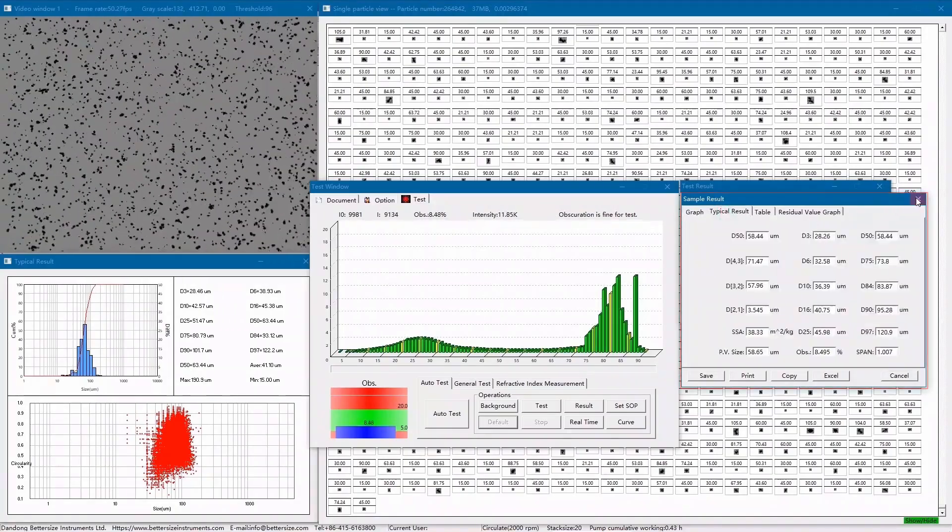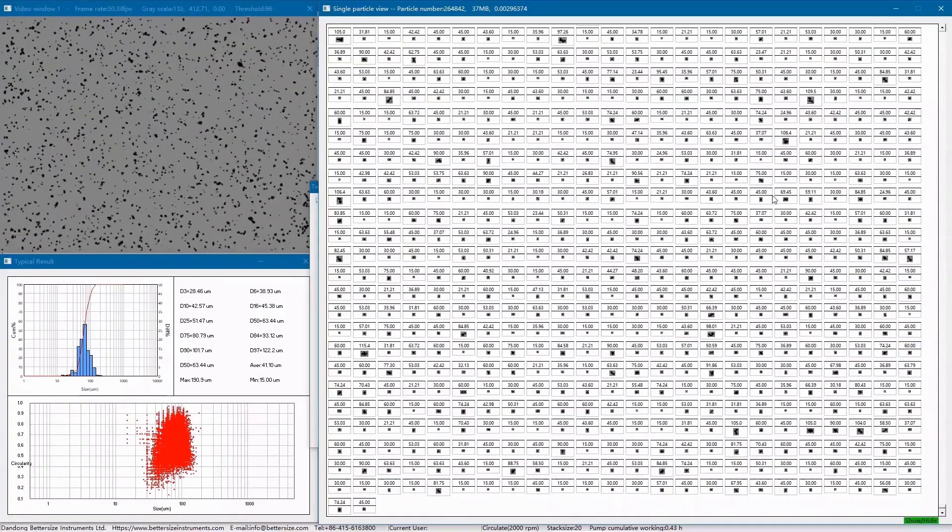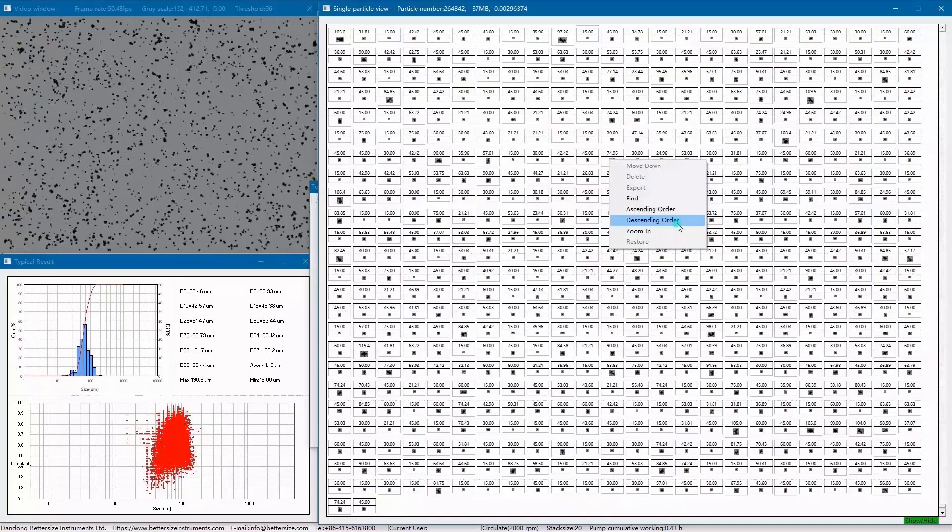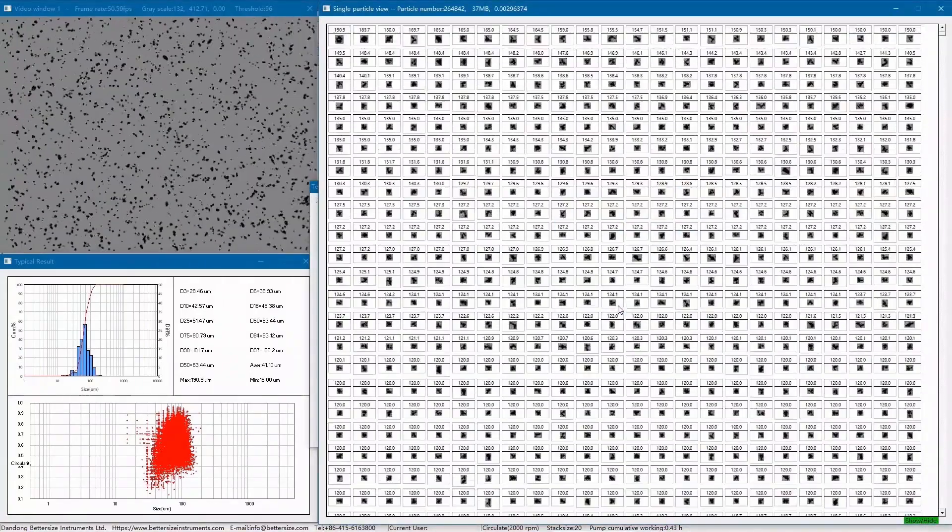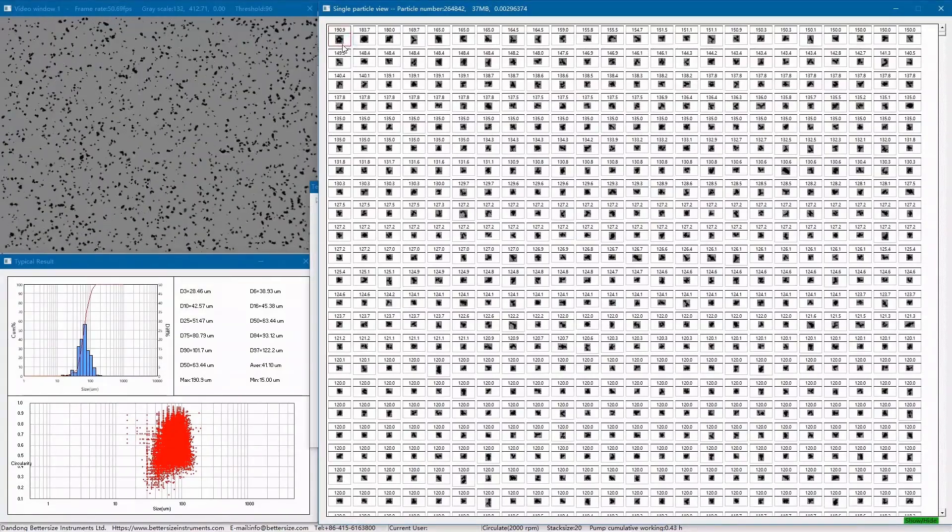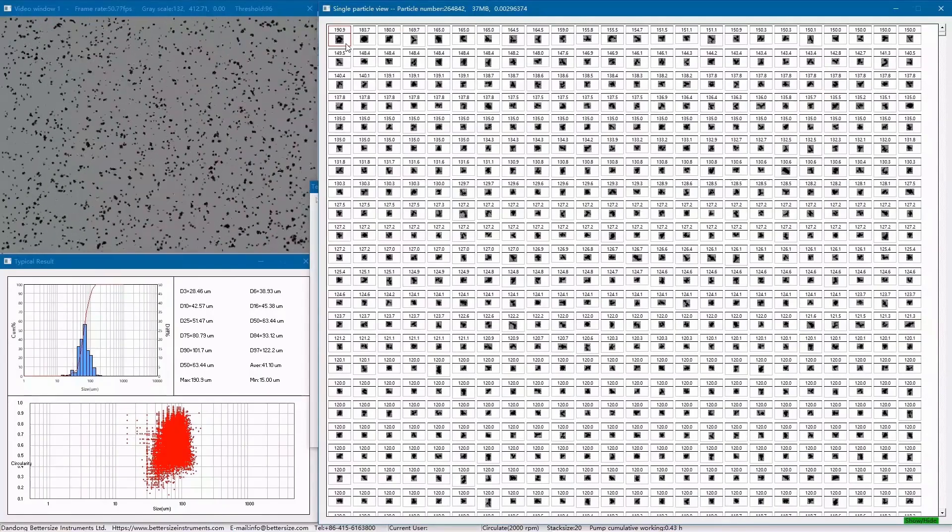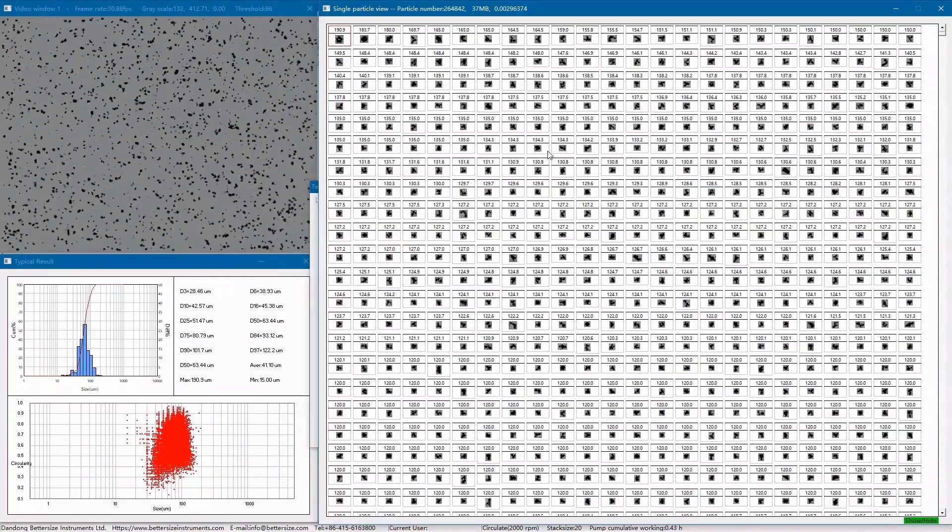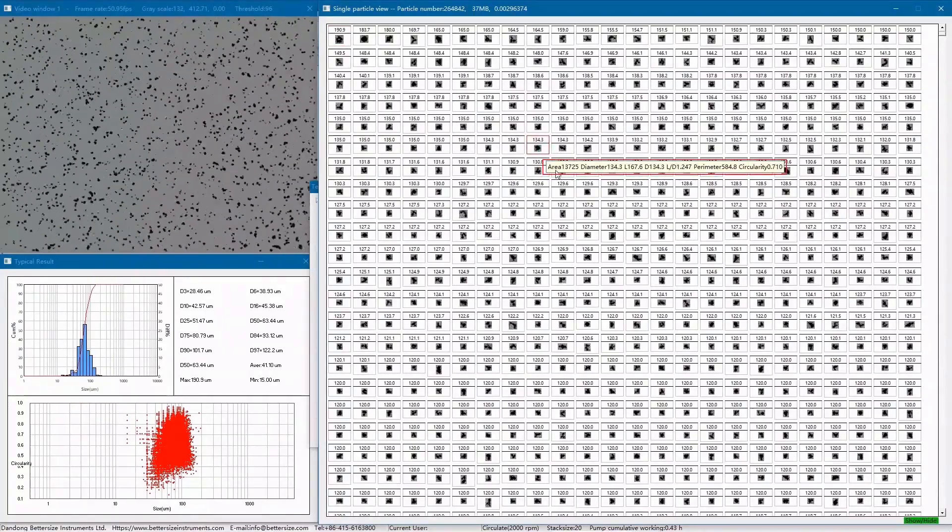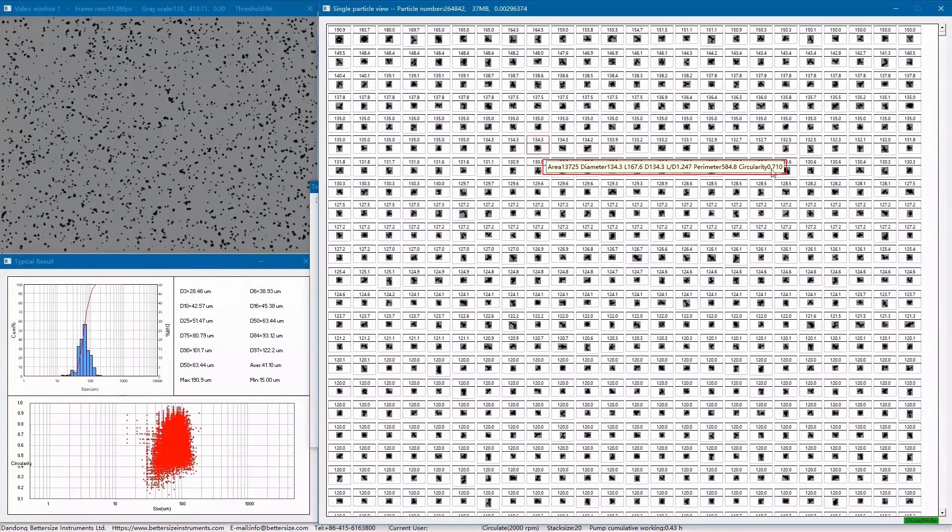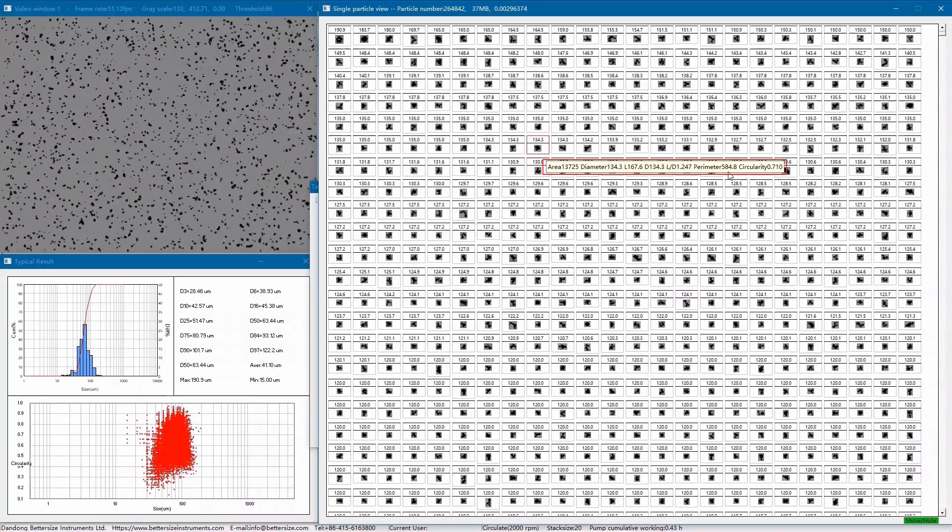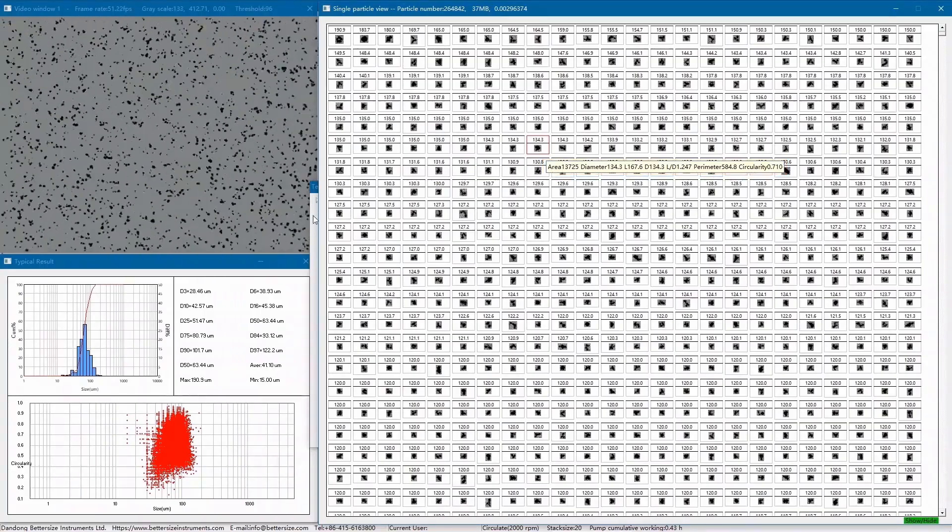In the particle view window, we can arrange the particles with different parameters. Here, I choose descending order, and sorting by diameter from largest to smallest. For this silicon carbide sample, we find that one of the largest particles is around 200 microns, and most of the particles are irregular. We double-click on the individual particle, and detail shape parameters such as area, diameter, L-D ratio, and circularity will appear immediately. Any particle can be clicked on, which is very intuitive.